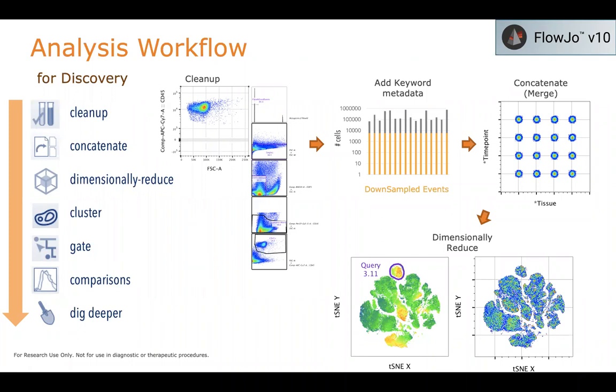Now, there is a caveat there. To be completely transparent, depending on how far down you downsample, how many cells you reduce, you can clip out rare events. So you want to be careful about just how far you downsample, especially if you are chasing rare populations of cells, right? So don't downsample too far if you are going to pursue rare cells. Okay, and obviously that's going to be a function of Poisson statistics to figure out exactly how many cells you need and whether or not the downsampling will cut them out or not.